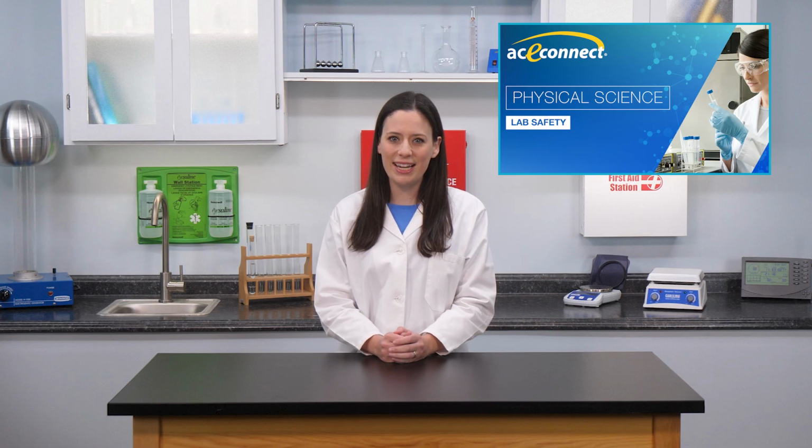In our previous physical science labs, we dealt primarily with inorganic compounds. In our next two labs, we will take a brief look at organic compounds. As always, before beginning any experiment in the laboratory, be sure you are familiar with laboratory safety requirements. For a demonstration of basic lab safety rules, you can watch our video entitled Lab Safety.